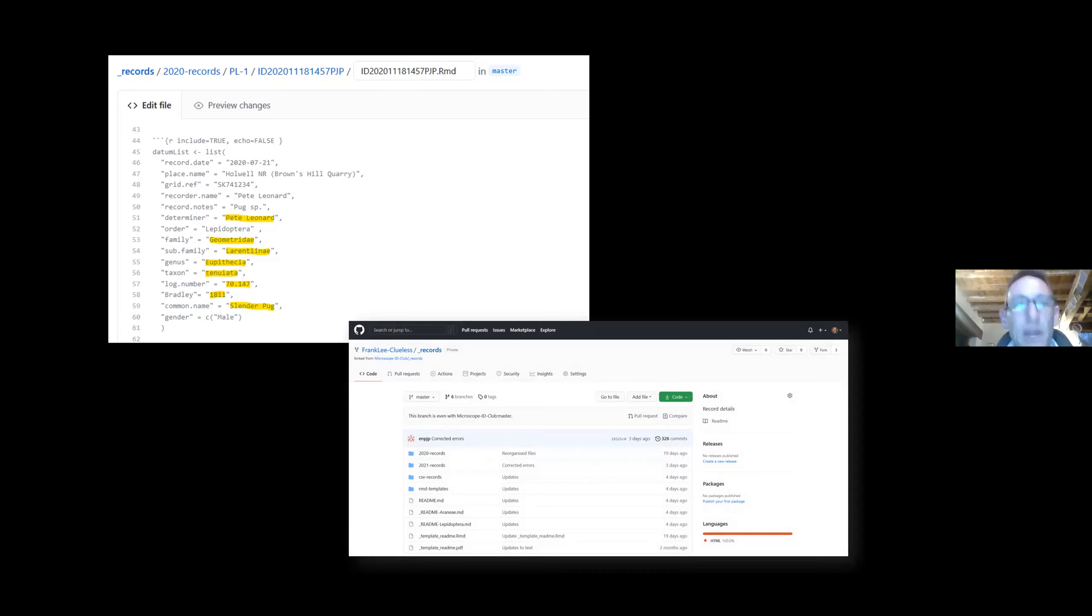The arrow I've put at the top takes you to a file pathway that will be at the top of your page. This shows us where we are at the moment. If you look all along that file pathway, it shows we're in records, we're in the 2020 records in the folder that's called PL1. There's the catalogue number of the specimen we're dealing with, and we're currently looking at the PDF. If we click on the one with the arrow going to it, it takes us back to the folder for this particular specimen. We can see there is the RMD, the PDF and the RDS files, but also there's a folder called images. That's what we want. We're going to click on the image folder and then we've got some images. Then there's another subfolder that's called dissection. That's what we want because we don't want the external photos. Then you've got the images of the dissection. You can look at these and choose which one you think is going to be most useful. You can go through the process which I went through earlier of whittling it down and trying to work out what it is using the resources I showed you.